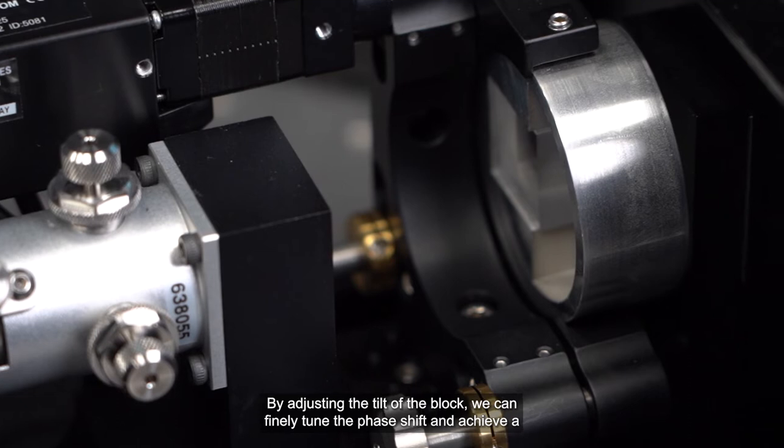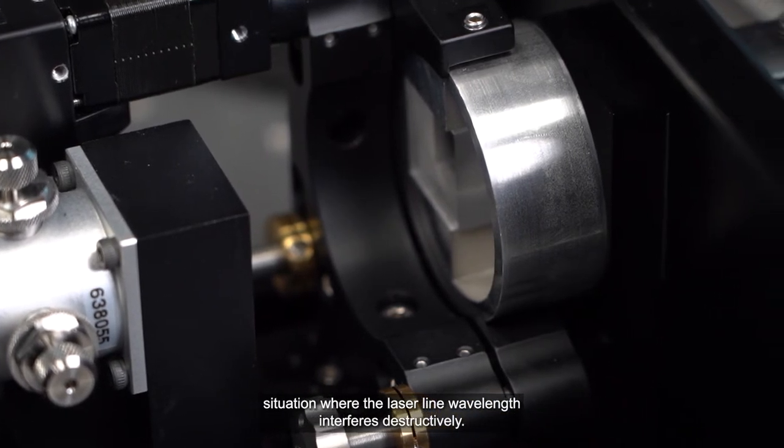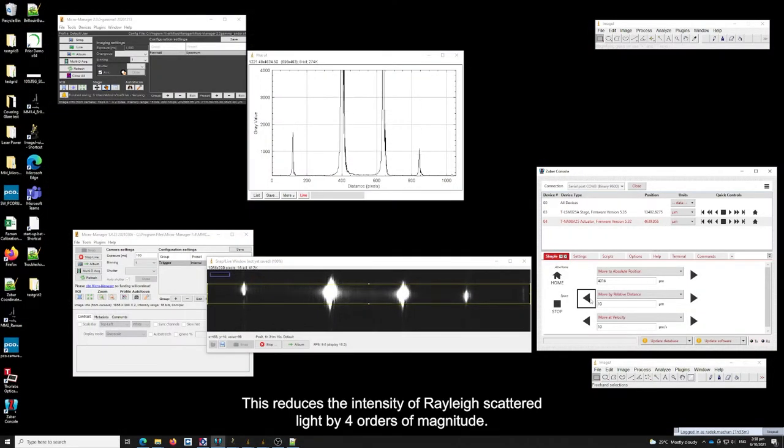By adjusting the tilt of the block, we can finely tune the phase shift and achieve a situation where the laser-like wavelength interferes destructively. This reduces the intensity of Rayleigh scattered light by four orders of magnitude.